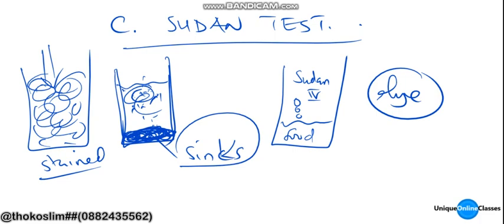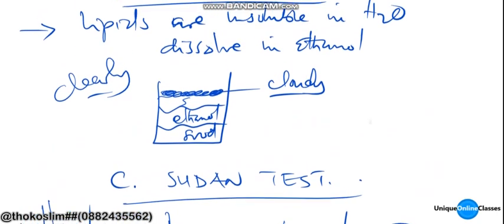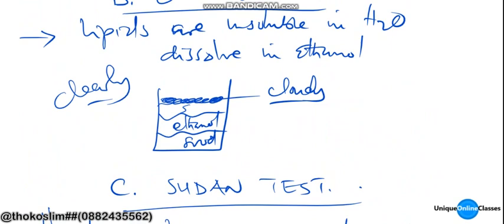That's about the Sudan test for lipids. And this marks the end of my video, and that's what I prepared for you.